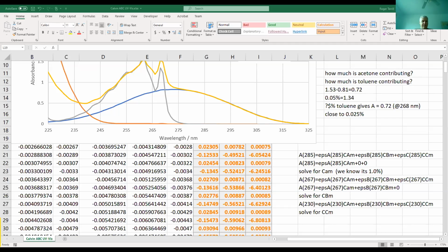It's not the type of thing where you would think, oh shoot, they're interacting chemically, let's do something else to measure them. Let's try to measure them with mass spec or infrared or something like that, which could get around the interactions.